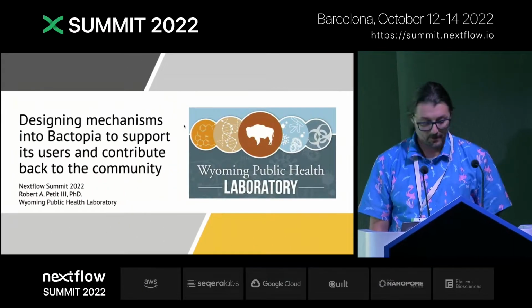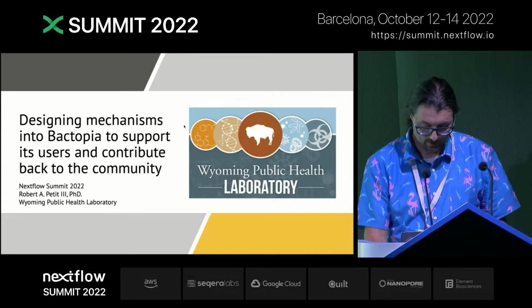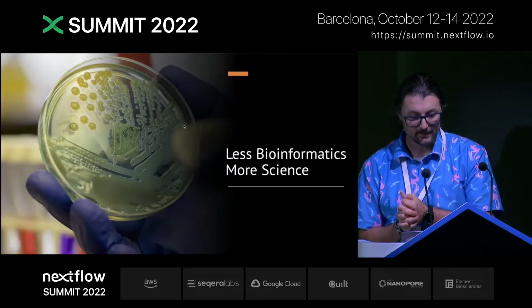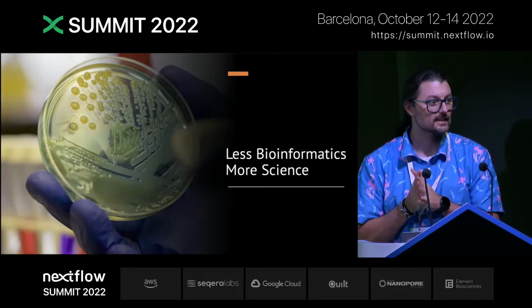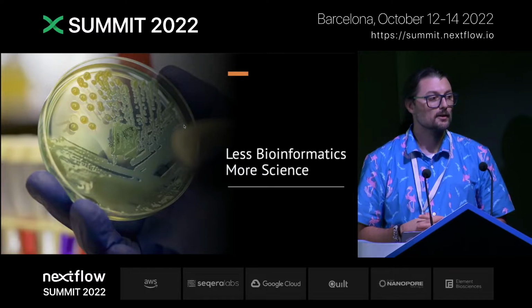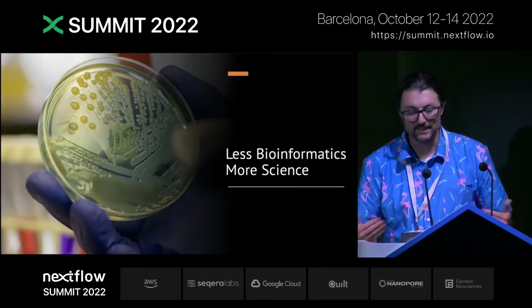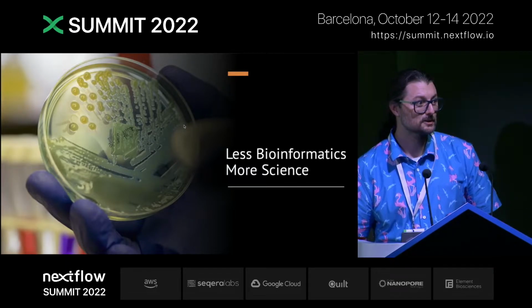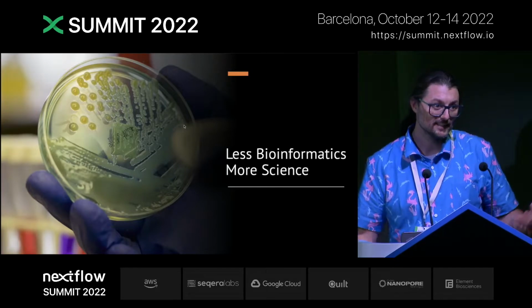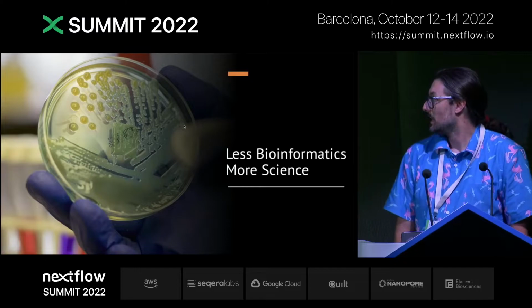But I am a public health bioinformatician, and things are a little bit different on the public health side. But yeah, let's jump right in. The goal on the public health side is to do less bioinformatics, more science. I very much enjoy creating bioinformatic pipelines. That's what I do. But on the public health side, you're probably more interested in us following up on a recent gonorrhea sample and knowing whether or not you should be traced out, like letting you know that, hey, you might need to get checked out.